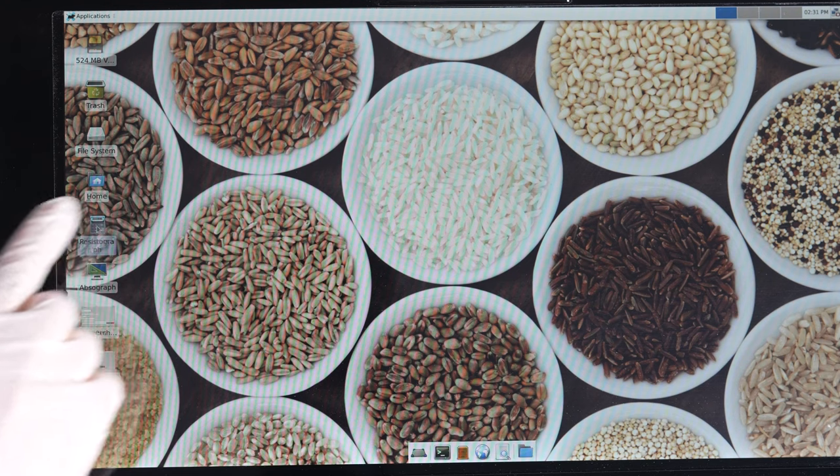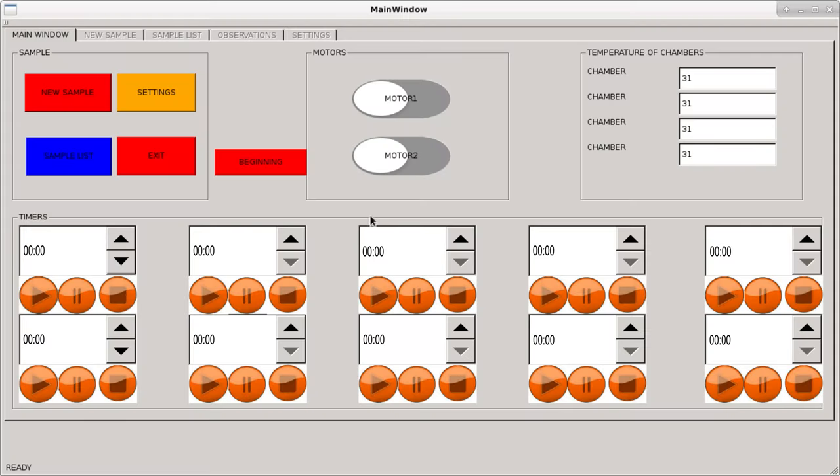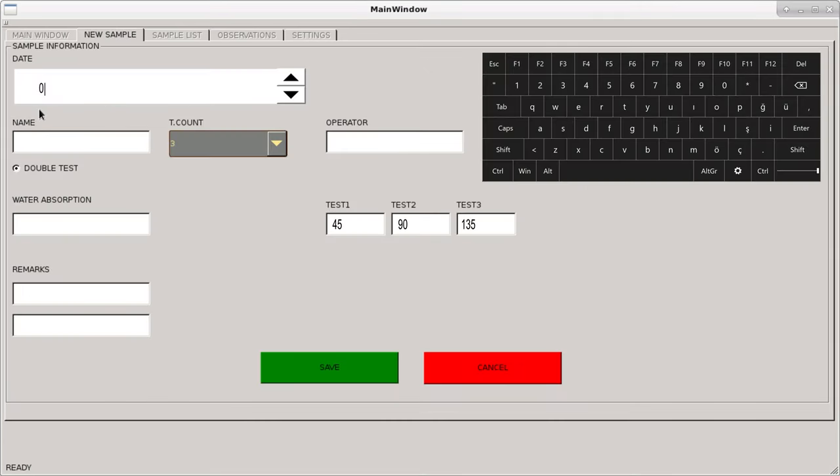Select the Resistograph indicator to start the test, then select the New Test indicator. The test date is automatically assigned by the system, and the operator can select a different date if desired. The sample and operator name, single or double test options, and test duration are displayed. The water absorption value and extra information about the sample are entered. By selecting the test option, test duration indicators of 45, 90, and 135 minutes are opened and saved.